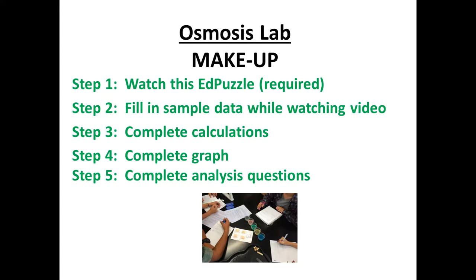Okay, once we've gone through the whole video, eventually you'll complete the calculations that are explained, you'll graph the data, and then complete the analysis questions. So basically, you're just acting as if this is your data from your lab that you happened to miss, but you're going to complete the lab report just as if this was your actual lab. So it's important to watch, listen, ask questions if you are confused about what the lab's actually about.